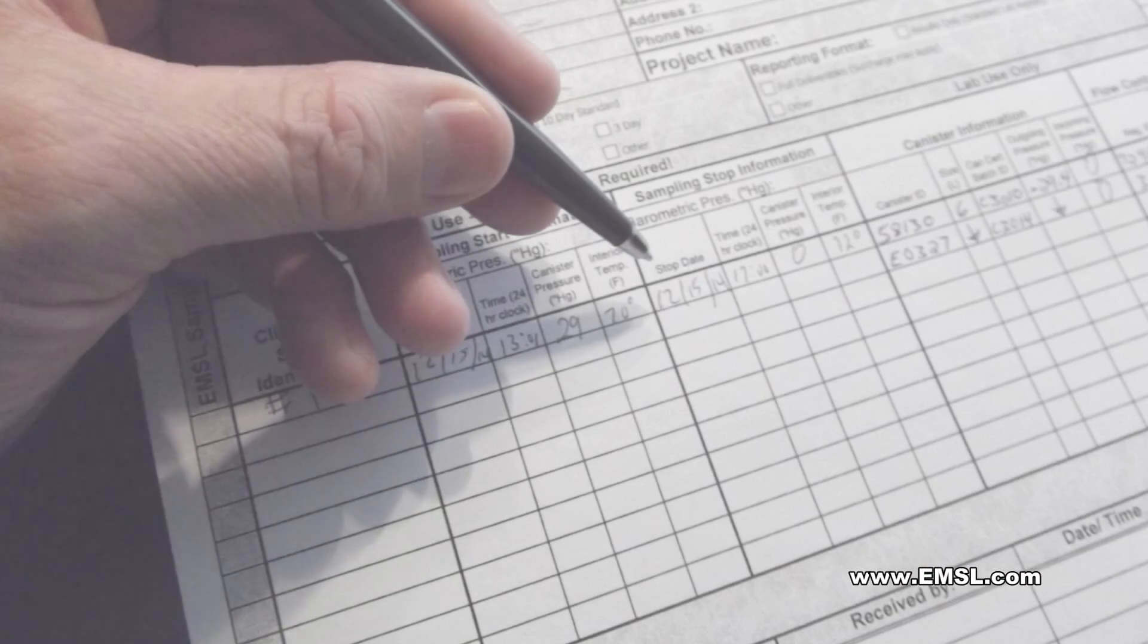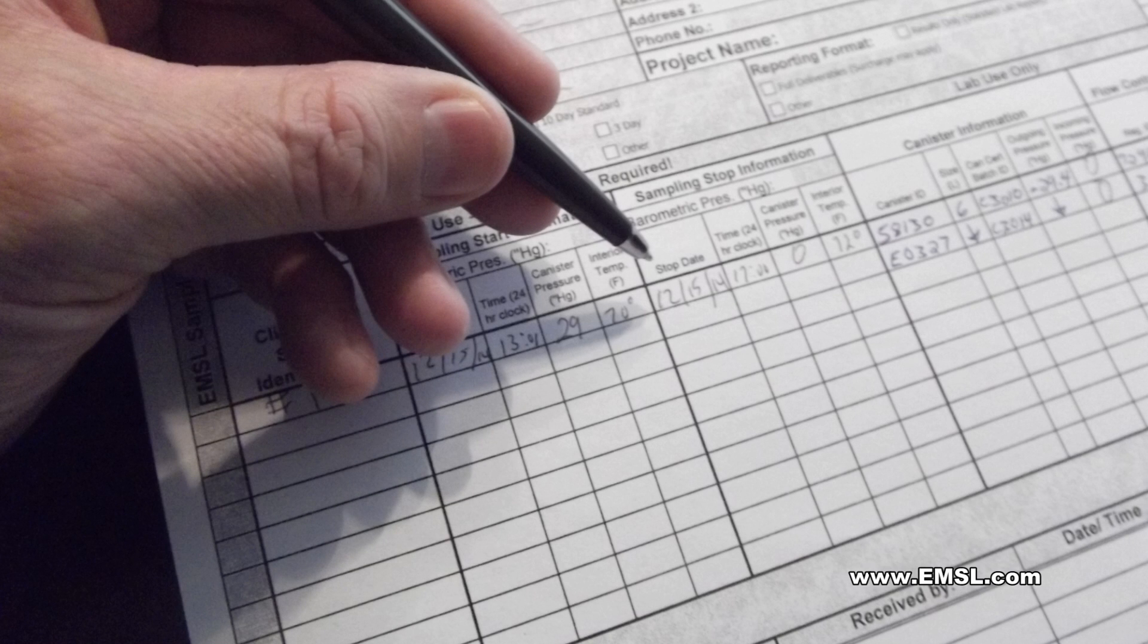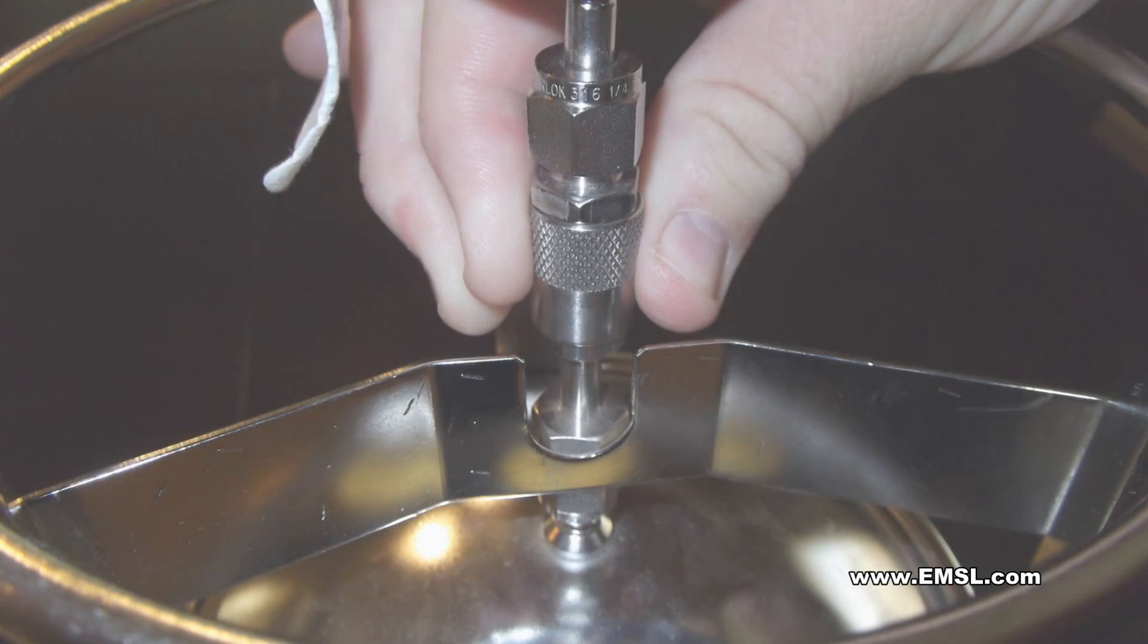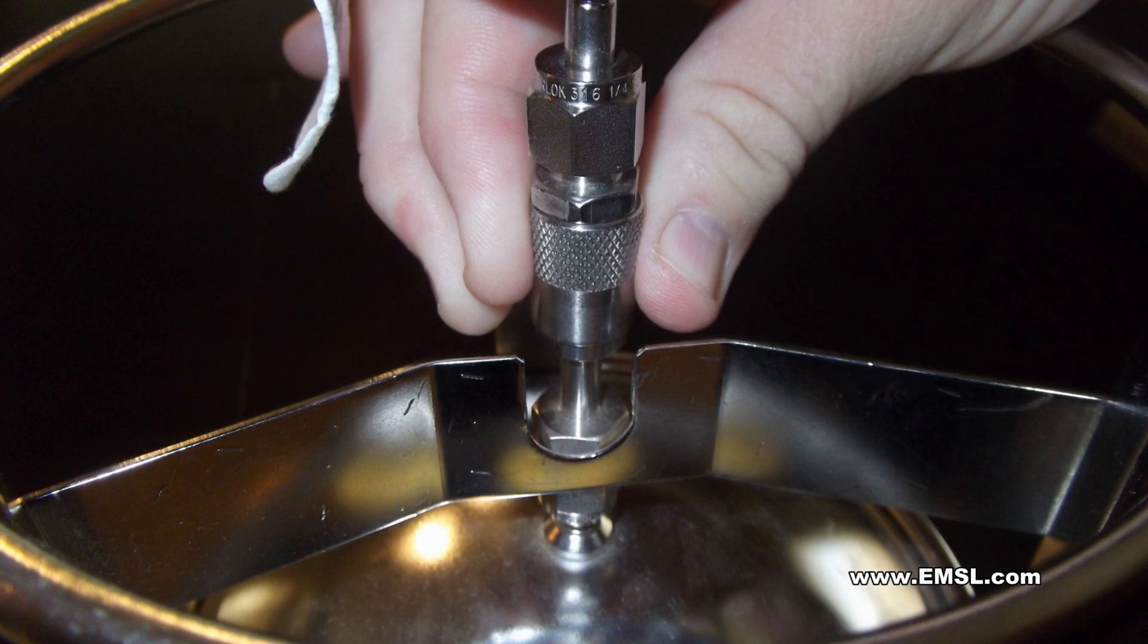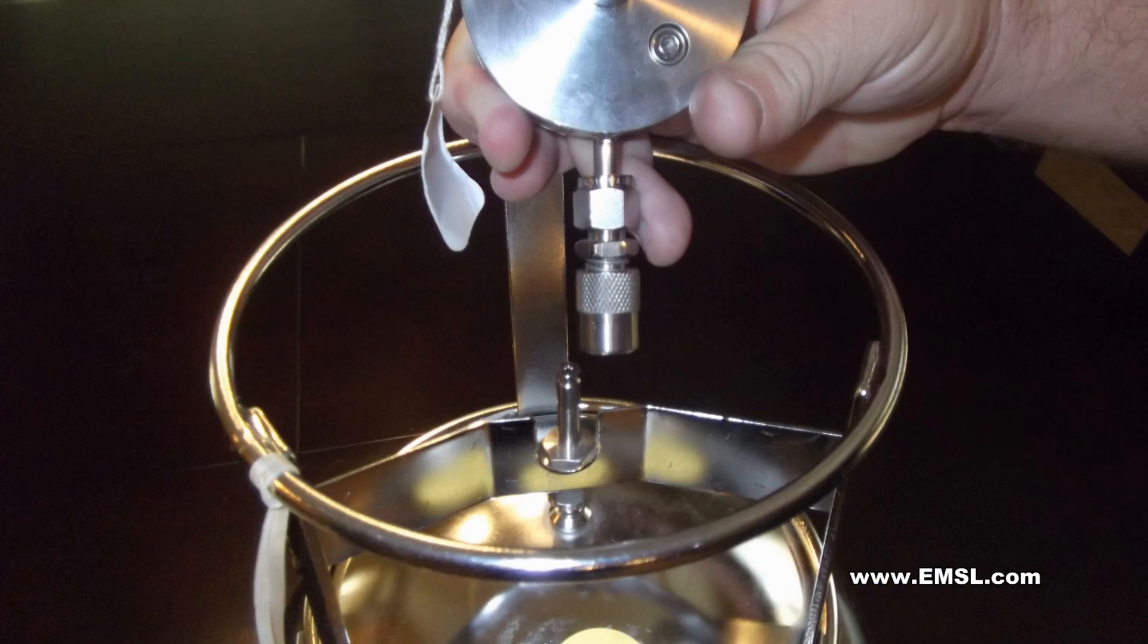After the sampling time has elapsed, record the final pressure, date, and time sampling was completed on the chain of custody form. To stop sampling, uncouple the QT valve by pulling back the sleeve on the QT valve body and remove it from the canister.